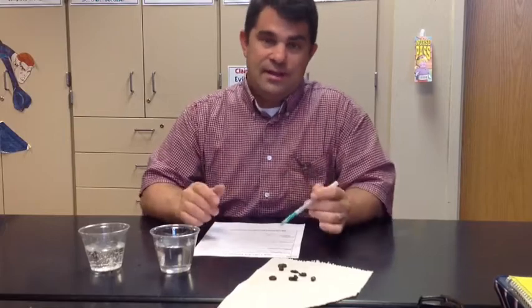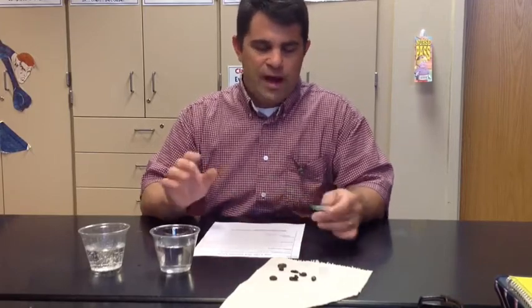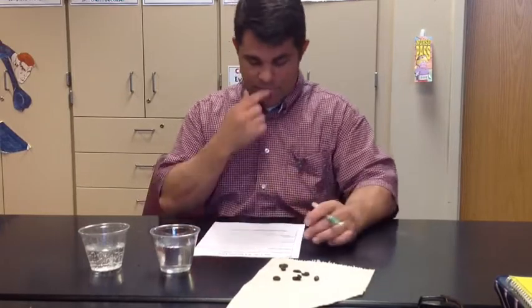Now, as I told you in the last lab, whenever we're using liquid it's going to be a given that we have some paper towels in the room. It's not actually going to help us with the experiment — it's just going to help us clean up afterwards.